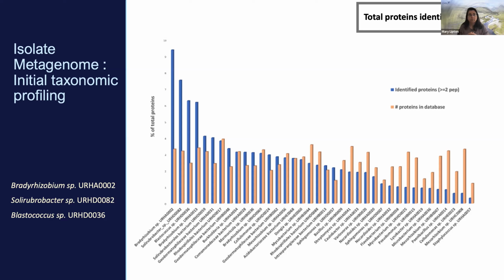And all this was done by taking the exact same data and searching it against these different genomes. In this case, we actually are using unique peptides, because if the peptides go across all of them, then we'd see straight lines. So the proteomics can actually reveal a lot about what's going on in a microbiome that the rank abundance profile won't. Again, if you looked at the rank abundance profile just by genomics, you'd expect a lot of these organisms, whereas we're seeing representation across the board.